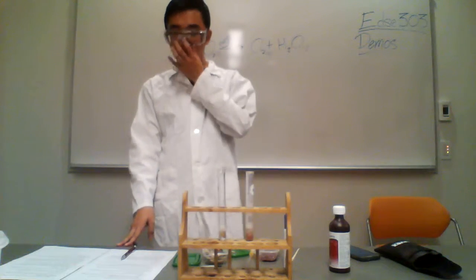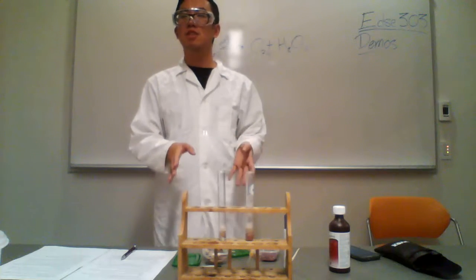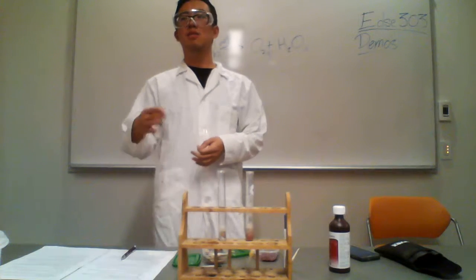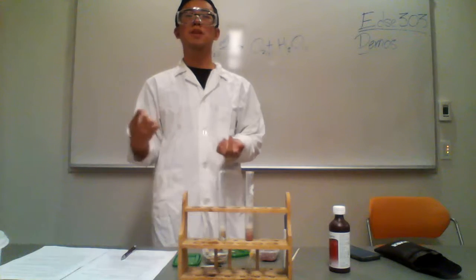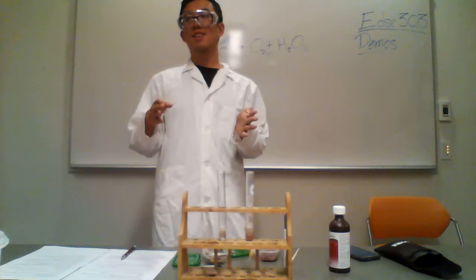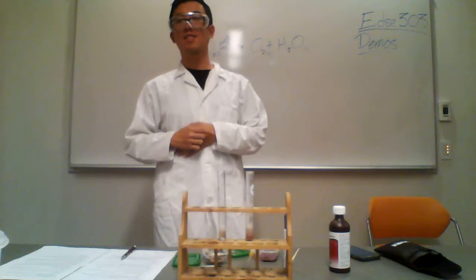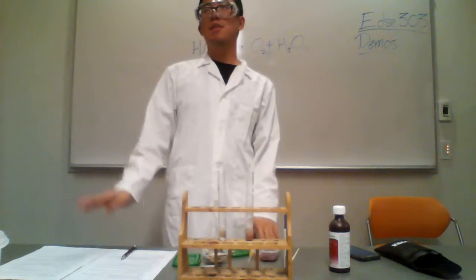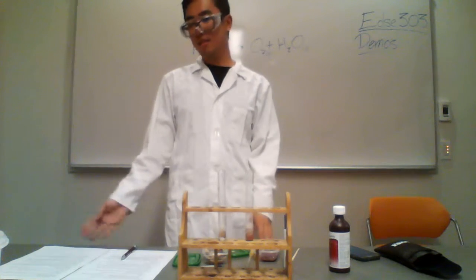So yeah, do you guys have any hypotheses of what you think the optimum conditions would be for this reaction to take place, like liver working on hydrogen peroxide? Your body temperature? Yeah, body temperature. What about acidity? Slightly acidic. Your body's slightly acidic, that's true, but the liver is actually completely neutral. It's a pH of around 7, and catalase actually, I probably shouldn't tell you this, works best at about 6.99 pH, very close to neutral.